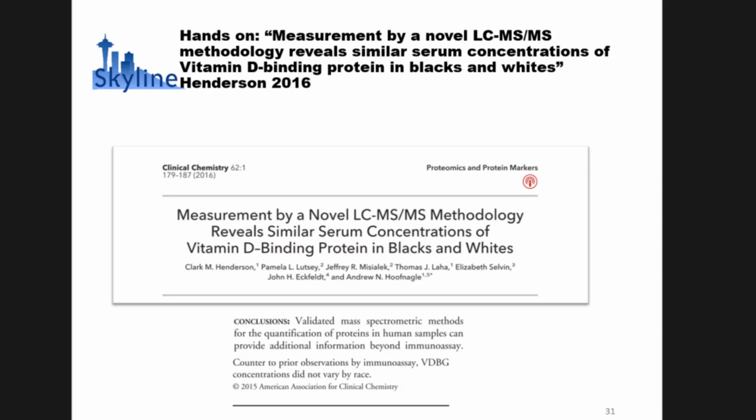For targeted proteomics, I think the most common way of controlling for LC variation is using internal standards and doing peak areas. That should control for the variation in LCMS, because you're spiking in that heavy standard. In larger scale proteomics, we try to do computational methods, dynamic time retention alignment, but we don't do that typically in targeted proteomics. If your LC is so variable that it's significantly adding to irreproducibility, it's kind of nice if you capture it in these so that you know.